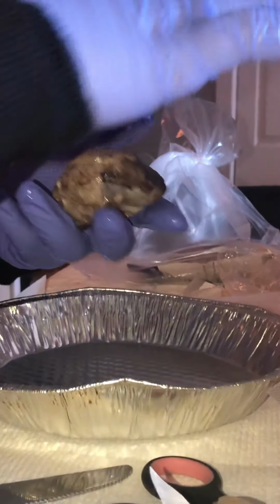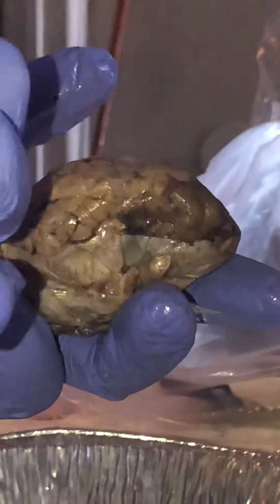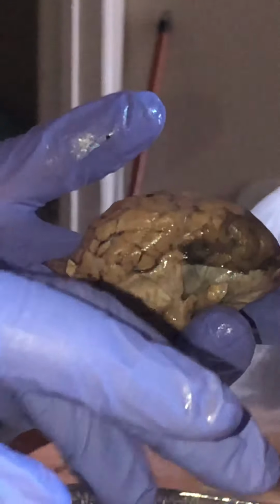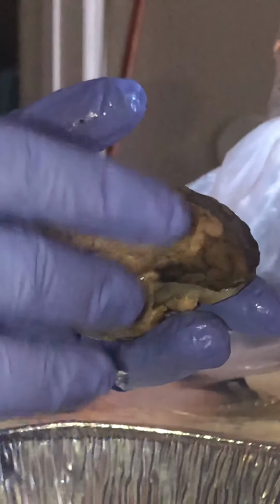This is the meninges, which covers the brain, and then CSF is the fluid that washes the brain. Then we have these sulci and gyri of the cortex.